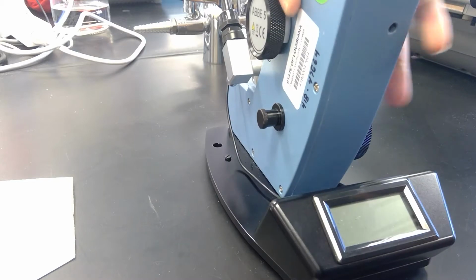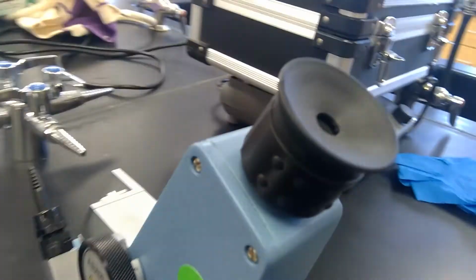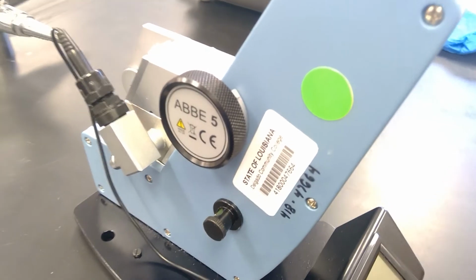All right. So what you're seeing in front of you is the Abbe 5 refractometer. We'll be able to see numbers once we get everything together in terms of putting our sample on. Here we have the little eye that we can look through, and the knobs, so that we can adjust what we're seeing on the inside. And let me put you guys close. You see the numbering at the bottom, and then you see the little crosshairs on the inside.